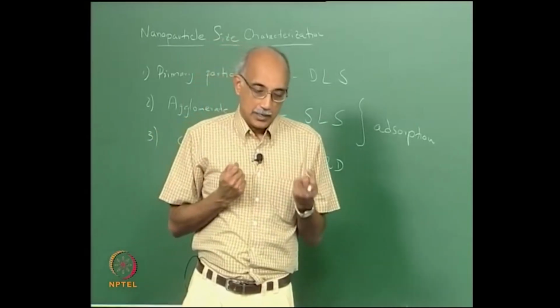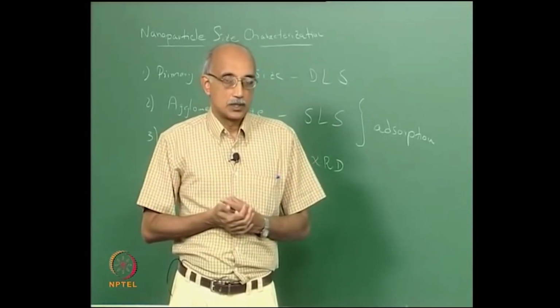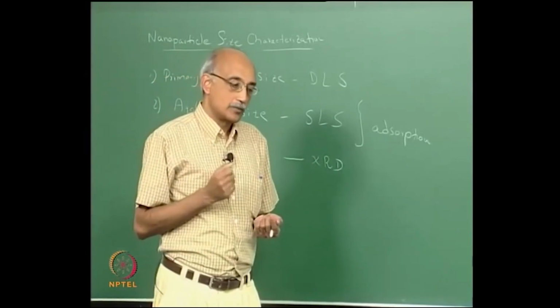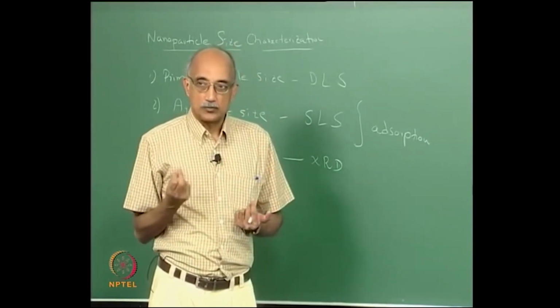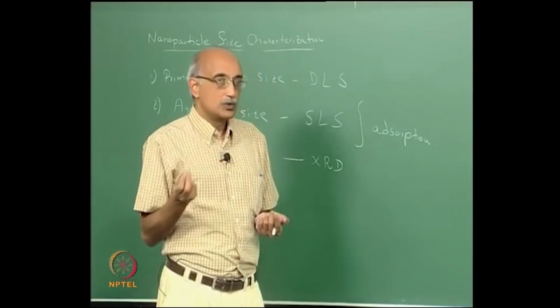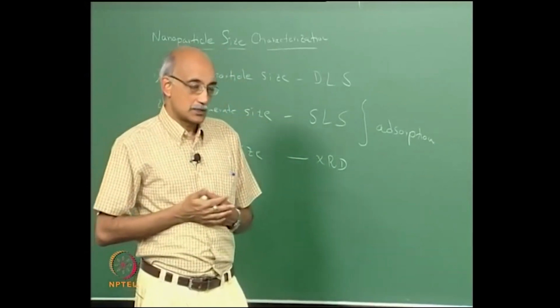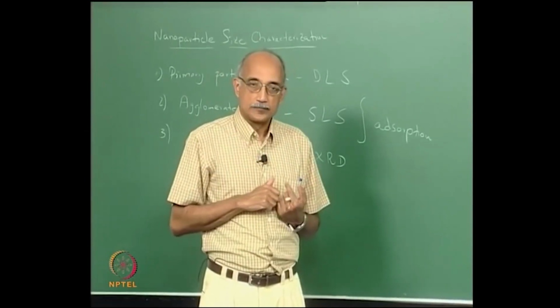For example, as fine particles start to agglomerate and become larger clusters, they actually slow down, because the primary transport mechanism in that size range is diffusion, Brownian diffusion. And Brownian diffusion essentially goes, the rate goes as the inverse of particle size. So, simply by looking at the Brownian diffusion characteristics of whatever it is that you are seeing in the fluid, you can actually assess whether it is a single particle or an agglomerate of particles.